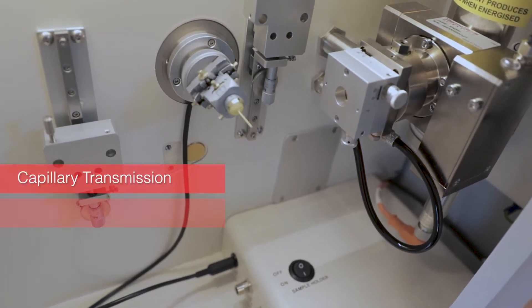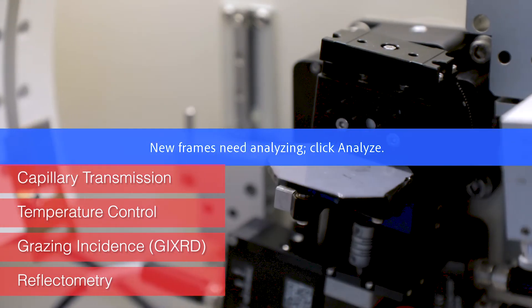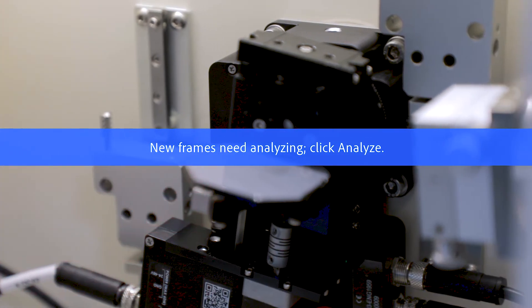Available accessory stages include capillary transmission, temperature control, GIXRD thin layer analysis, and reflectometry.